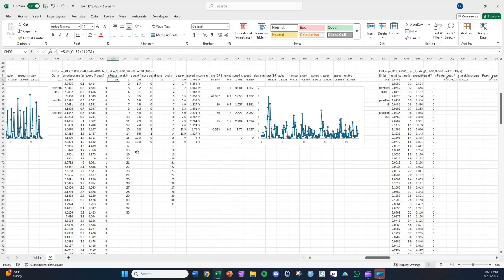When we said the peak has to be at least a value of 1, there are now 33 peaks identified instead of 1. So going through that here, that was this column basically. What this column is doing is taking this parameter value into account as well as other parameter values, which I'll explain now. So I'll go over that.